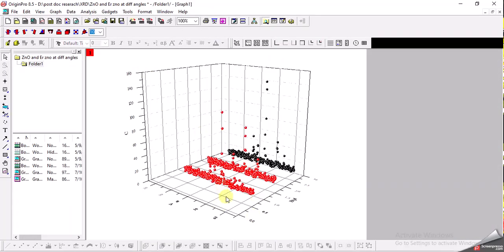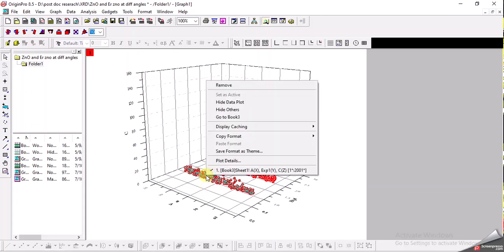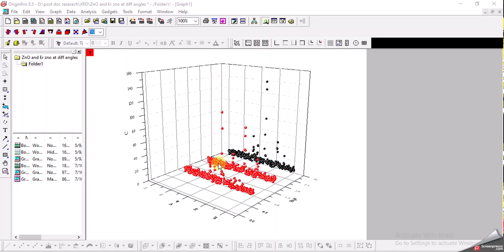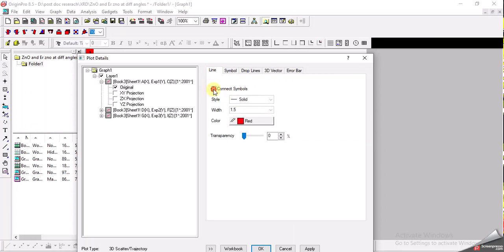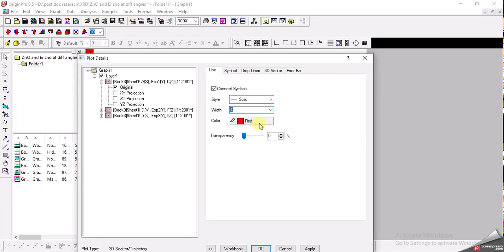Now we have a 3D plot but it's very messy and I can't see the lines. What we can do next is transform these spheres into plain lines. By right-clicking, I go to Plot Details, and set the symbol size to 0. Then I choose a line, increase the thickness of the line, and set the color to red. I click Apply.